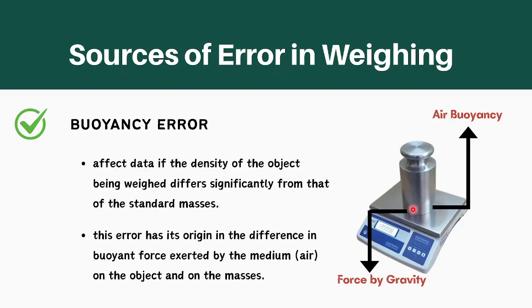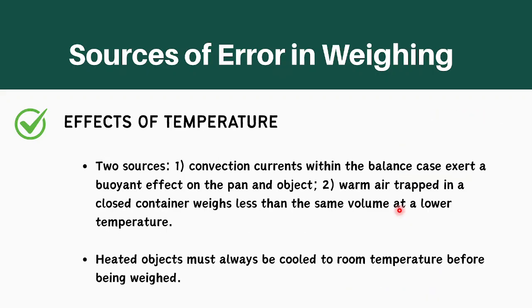And this can affect the overall accuracy of the mass that we get from a particular object.